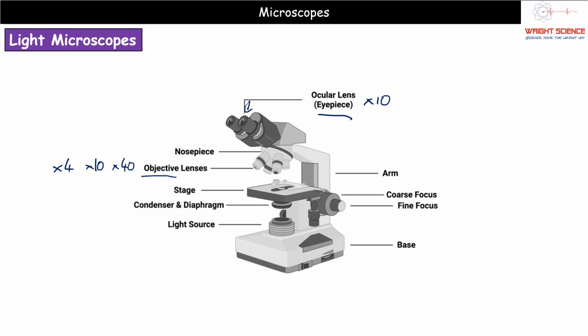If you've still got some of the more basic models, let's say, then you've got no controls for the stage. You can literally just move it up and down. You can't move it side to side and up and then forward and back. The A-level microscopes, which hopefully you've had, allow you to move the stage around, because that means that you can then get your image where you want it to be without trying to maneuver a slide, which always ends badly.